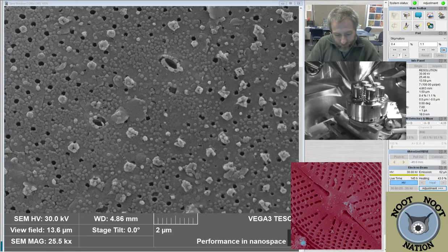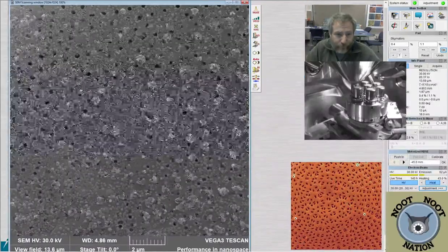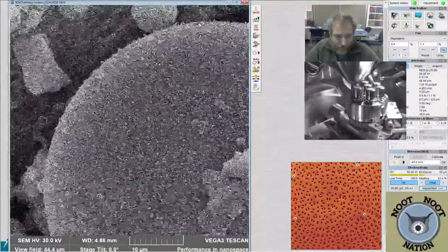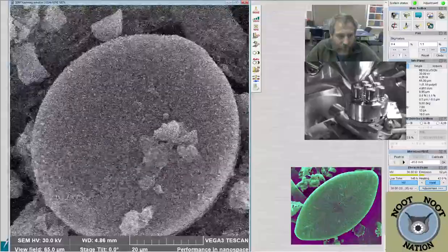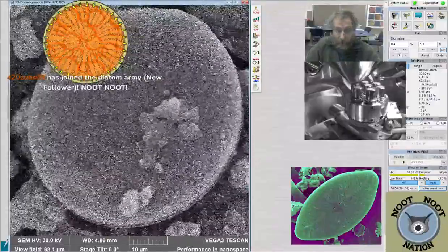Pleurocyra, external rimaportula hole. And then, my job never is boring. It never gets old. It's always something new that we could explore and find. I guess I'll do one where it's the whole diatom, and then maybe we can zoom in on one of the elevations.